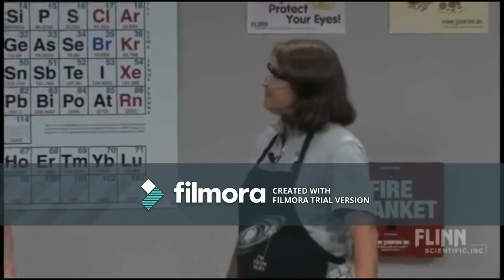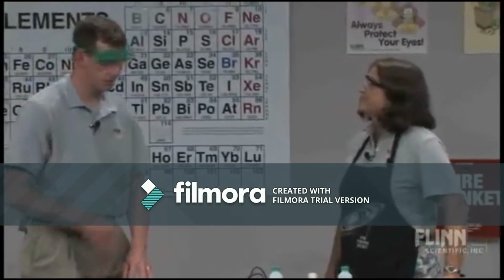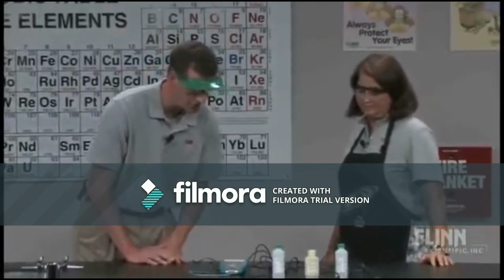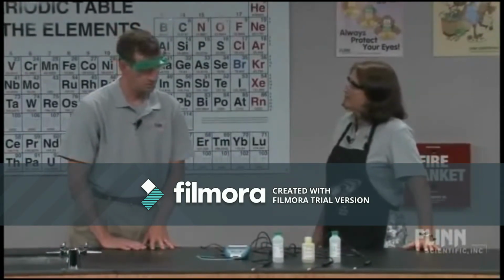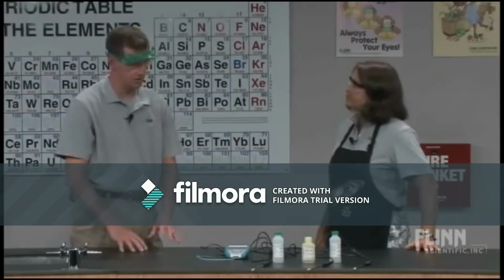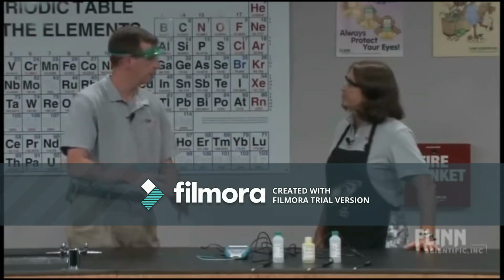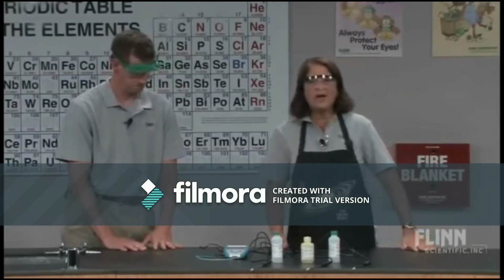I know that occasionally my students will ask me about the temperature. What if we tried the probes in different temperatures? How could you do that? You could put it in a cooler with some ice off to the side, a refrigerator, or under a heat lamp, and check the different temperatures at which we could evaporate things. See how that would affect your graph.